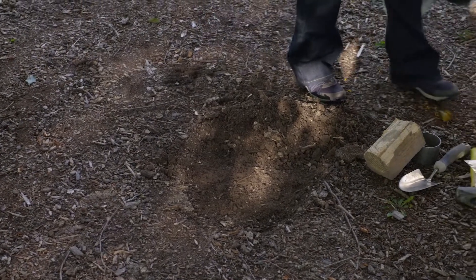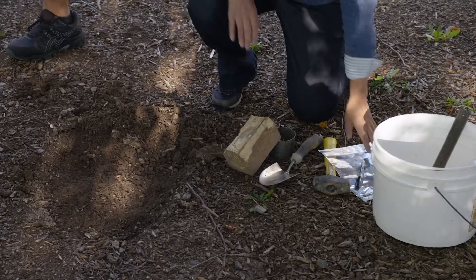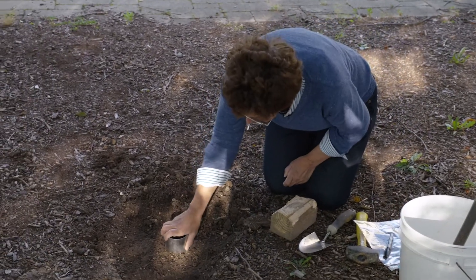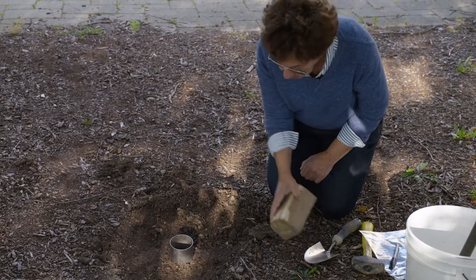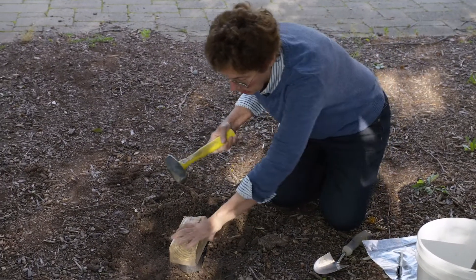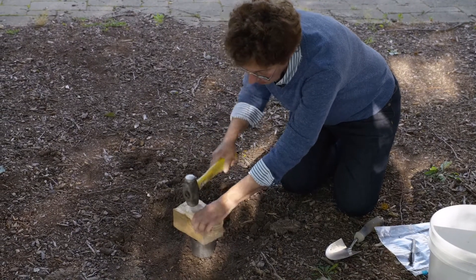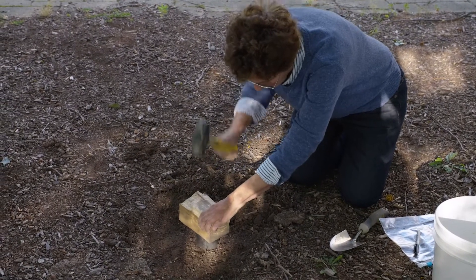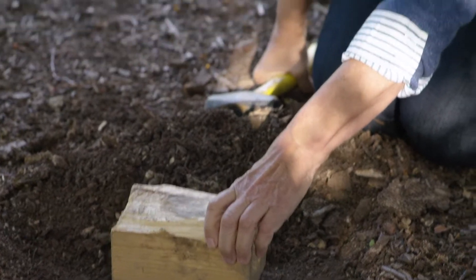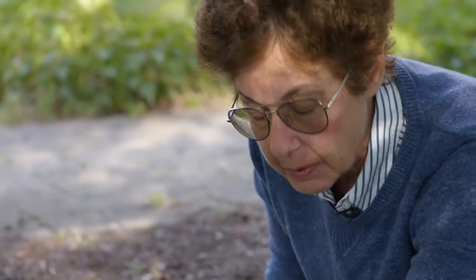Once that's removed, we're going to take a known volume, which is this cylinder here, and place it on the soil, put a block to distribute the weight, and basically push that cylinder into the soil.